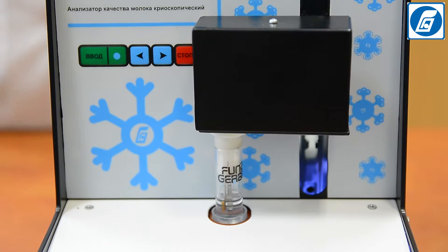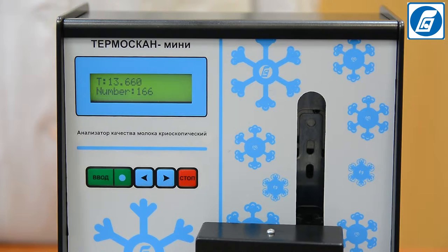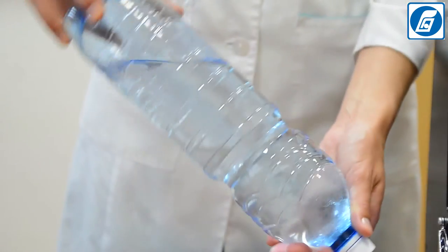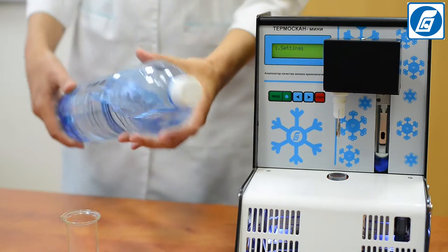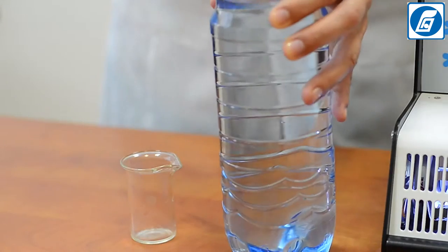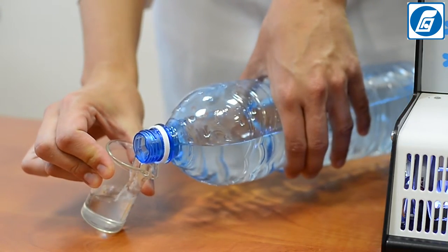Prepare the standard solution with a freezing point of –0.512°C in accordance with the operation manual. Store the solution at 5°C in well-stoppered plastic bottles with a capacity of no more than 250 cm³. Before use, slowly rotate the bottle several times to carefully mix its contents. Do not shake the solution, as this can cause air bubbles.